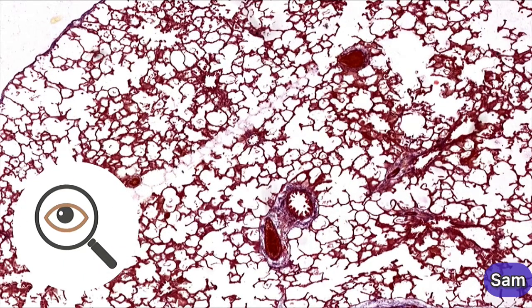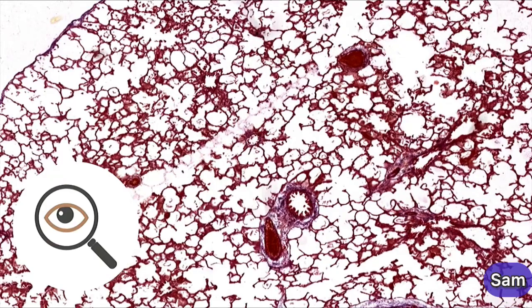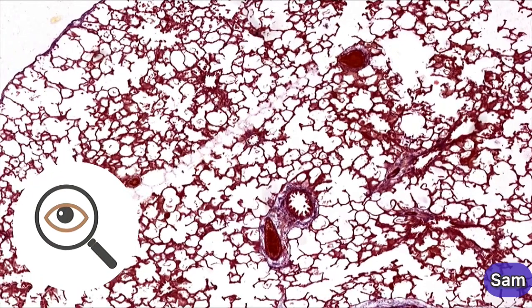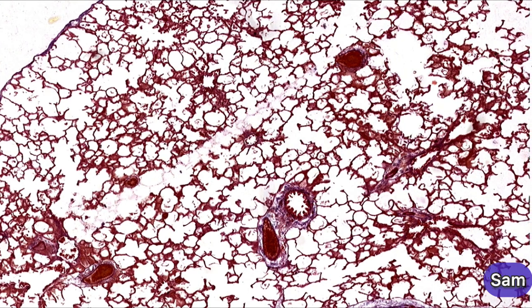So let's begin by talking about the appearance of this slide. The first thing that tells you that this is lung tissue is that it looks like an expanded net of tissue over empty space. So we know that the lung fills with air and expands, and in this slide you can see how the expansion is preserved during the preparation of histology slides. We can see it here as an empty space, circumscribed only by thin walls forming incomplete circles around the air. These thin walls are the walls of the alveoli, but don't worry, we'll explore these structures in much more detail a little bit later in the tutorial.